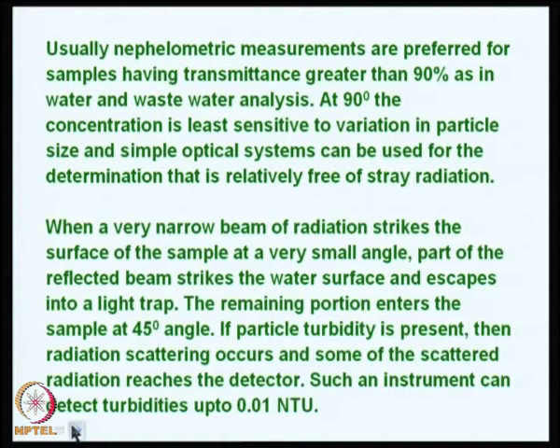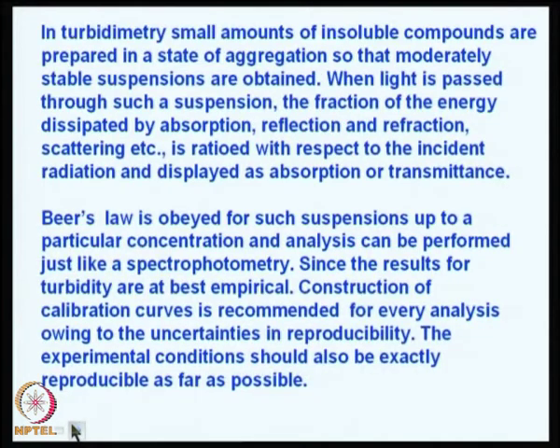Using this water turbidity, the quality of water can be determined using nephelometry. So, you need a standard sample which shows around 4000 NTU, and that can be diluted sequentially to get 4, 5 etc. If the drinking water has about 5 NTU, then it is acceptable as drinking water.